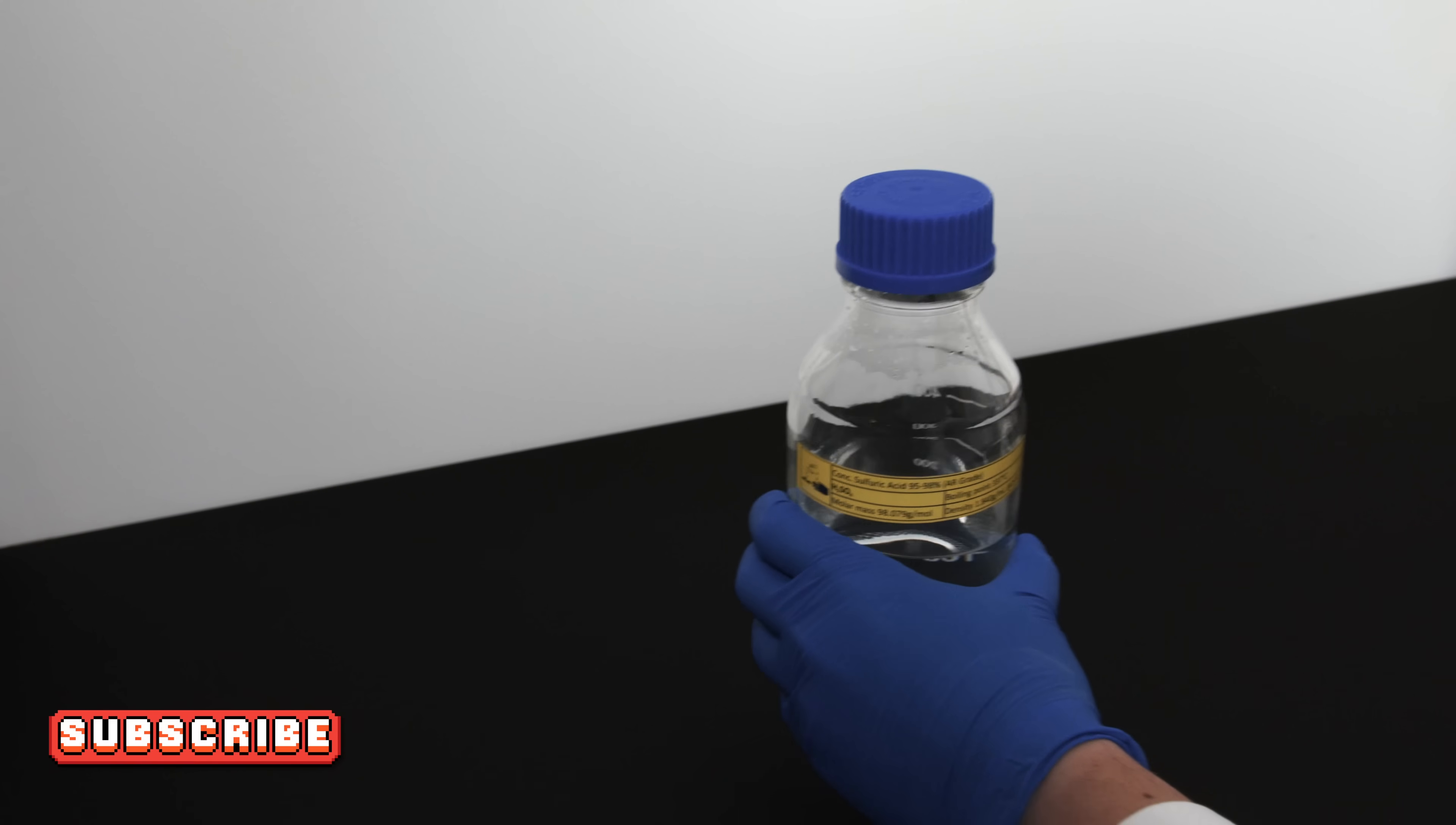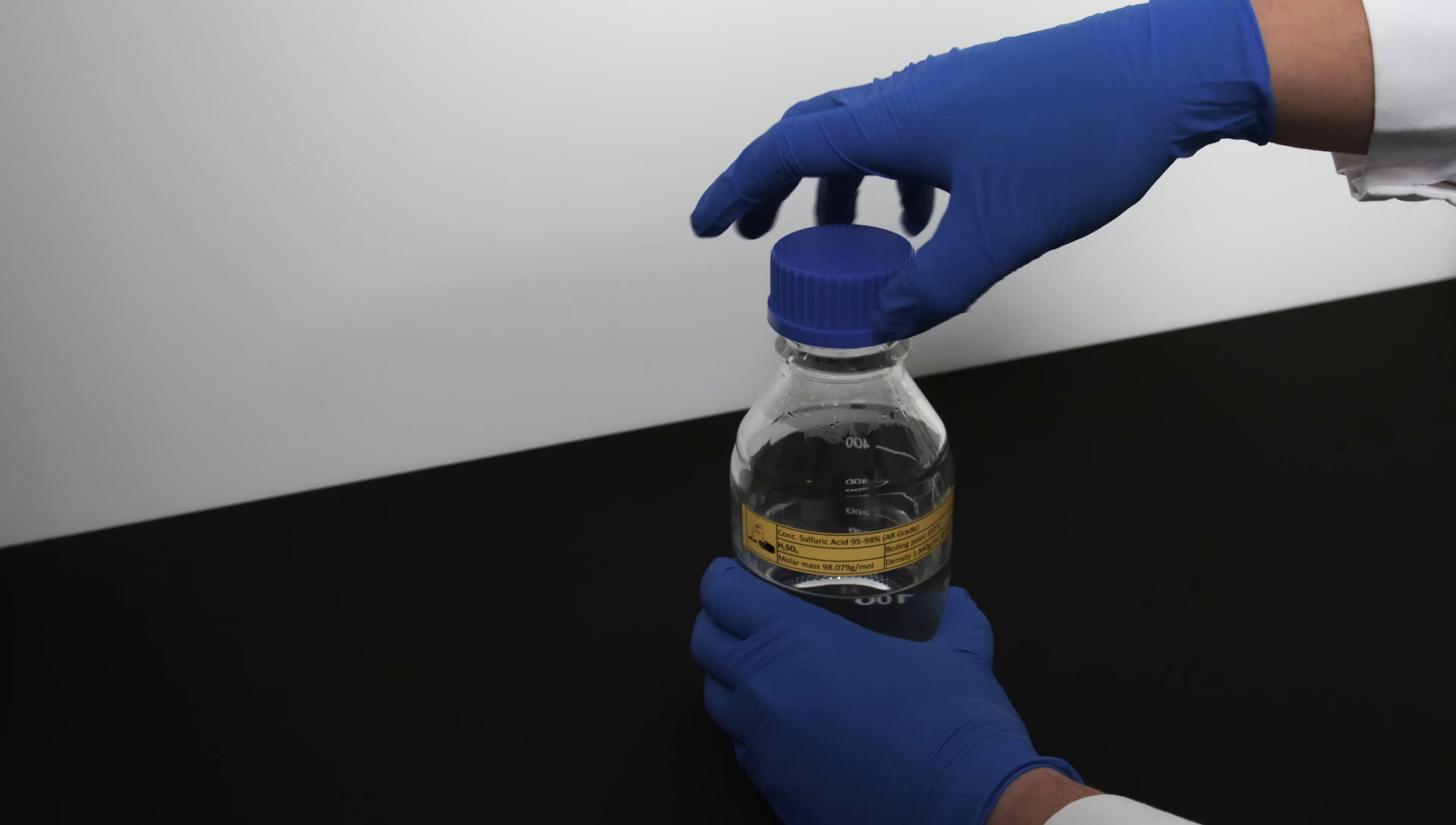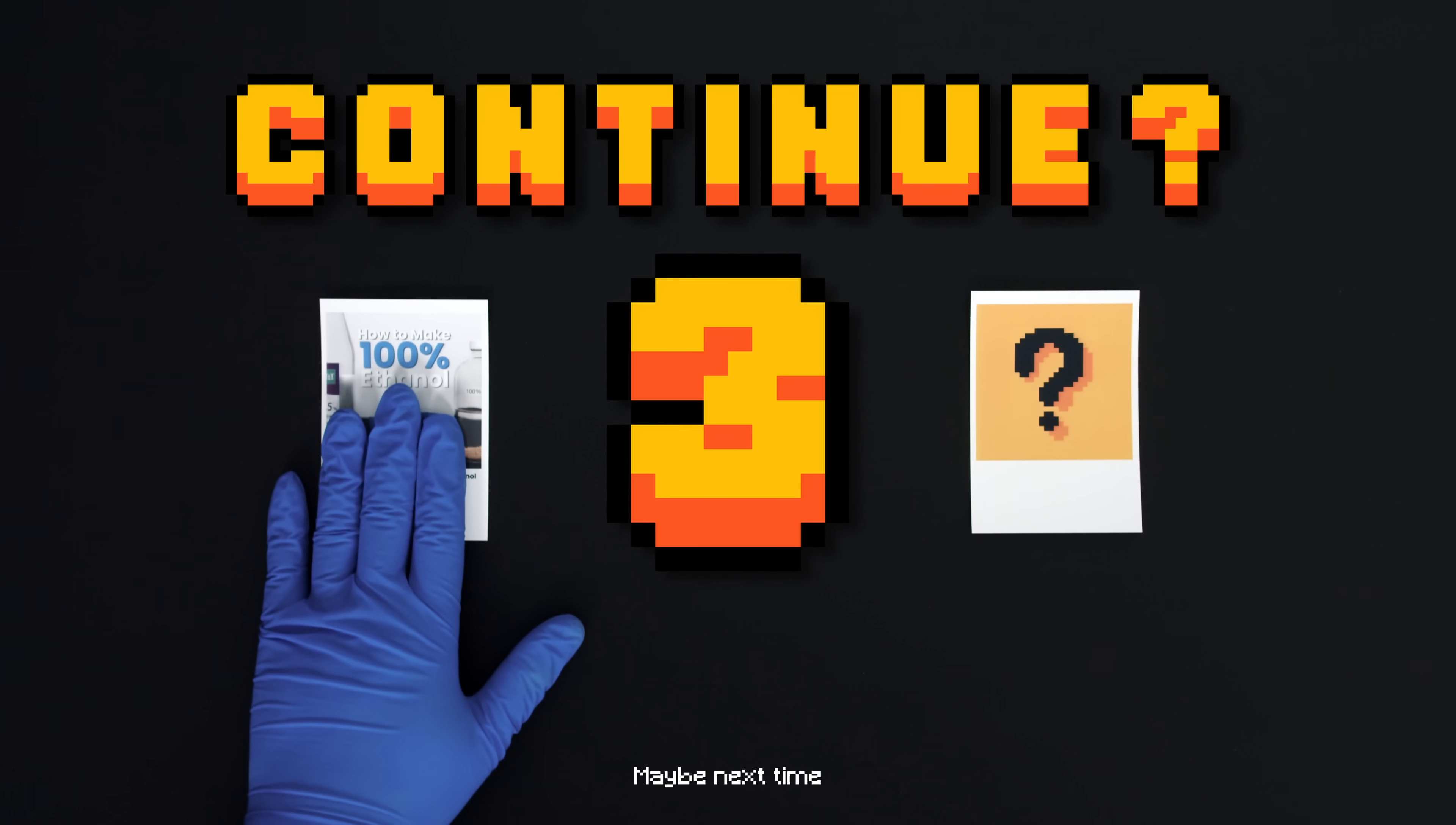Oh, one last thing. Room temperature concentrated sulfuric acid doesn't hurt your skin as much as you would think, provided that you rinse it off quickly enough. Let me show you.